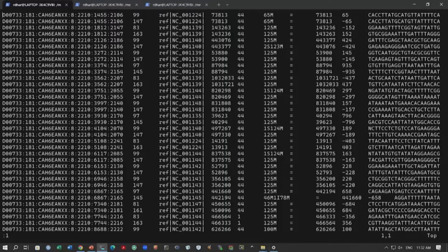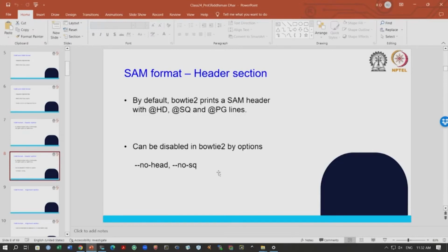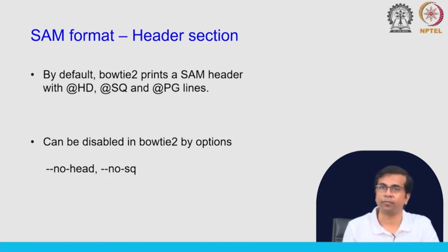You see a lot of information in this file, and we will interpret what this information means. This is very important if you want to write the code yourself to process these files. So, we will go back to the presentation and I will introduce these terms, and then we can come back to this file and have a look. What kind of information do we have in the actual results, and how do you interpret that result?